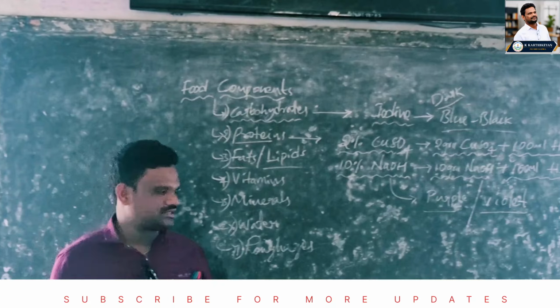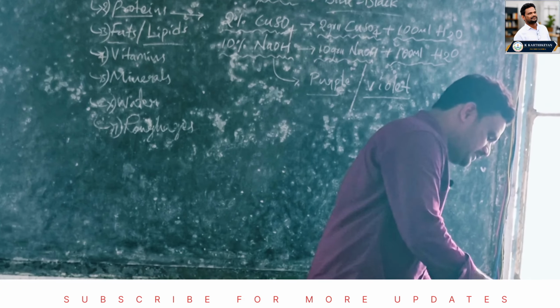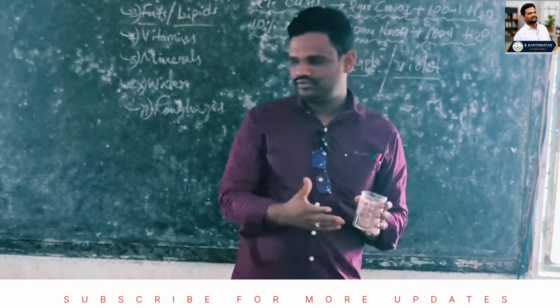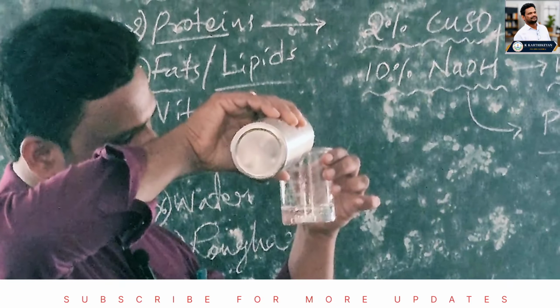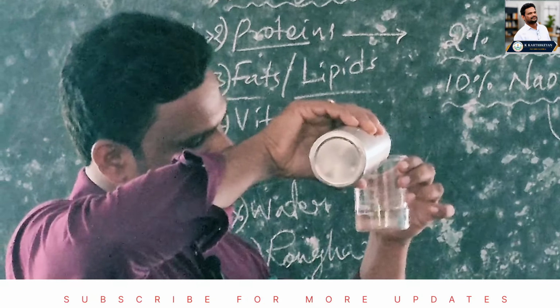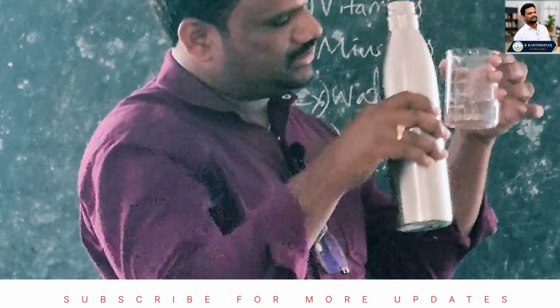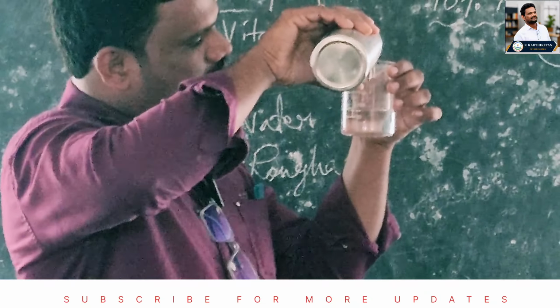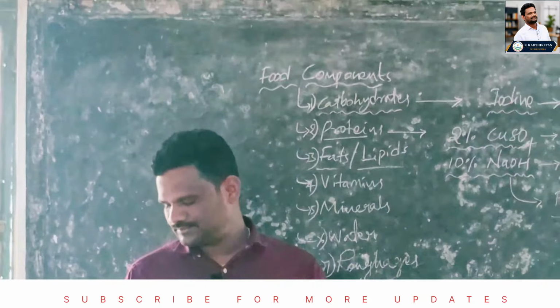Now we need 10% NaOH. To make 10% NaOH, what do we have to do? Again we have to take the same 100 ml of water. Into the 100 ml of water, how many grams of NaOH are needed to make 10% NaOH? 10 grams.